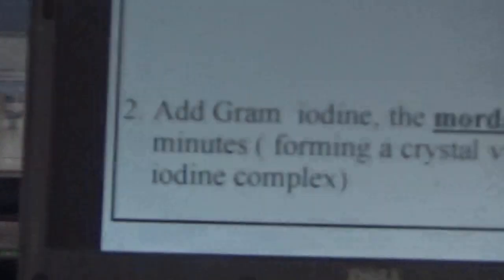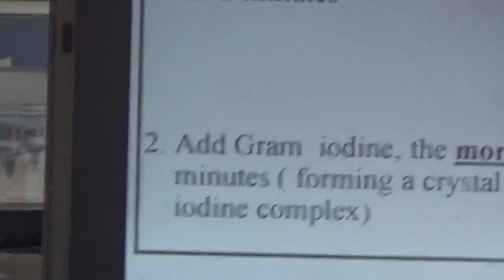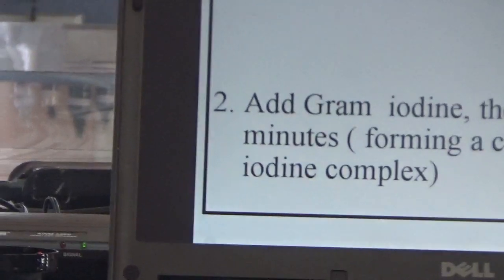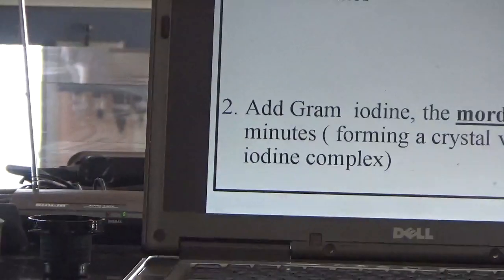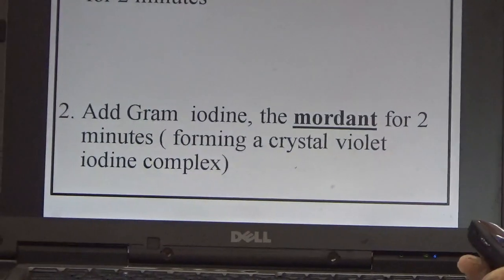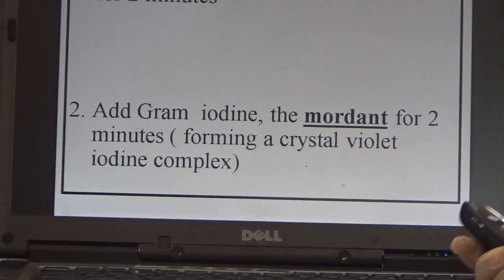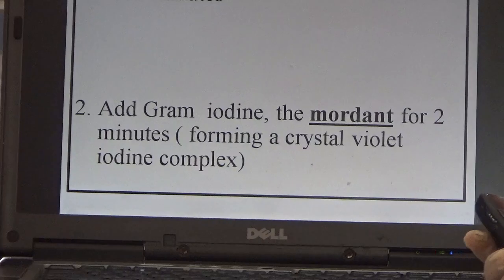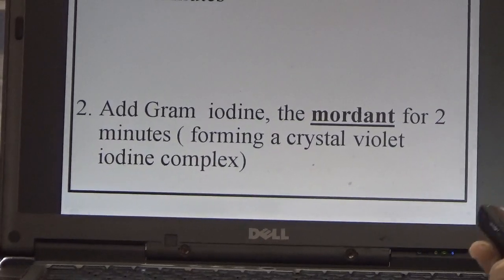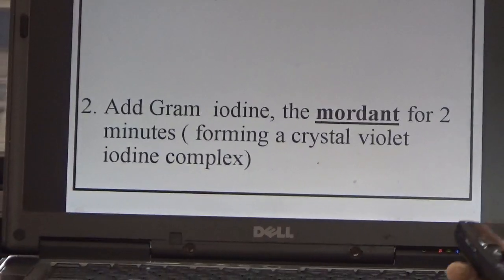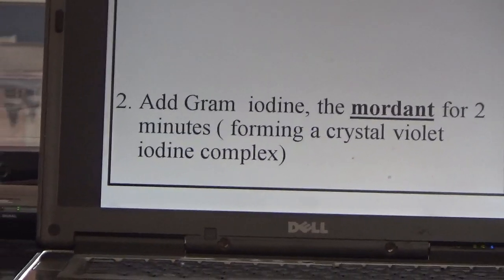After waiting for 2 minutes, add Gram iodine, which acts as a mordant, and wait for 2 minutes. It is used because it forms a crystal violet-iodine complex.